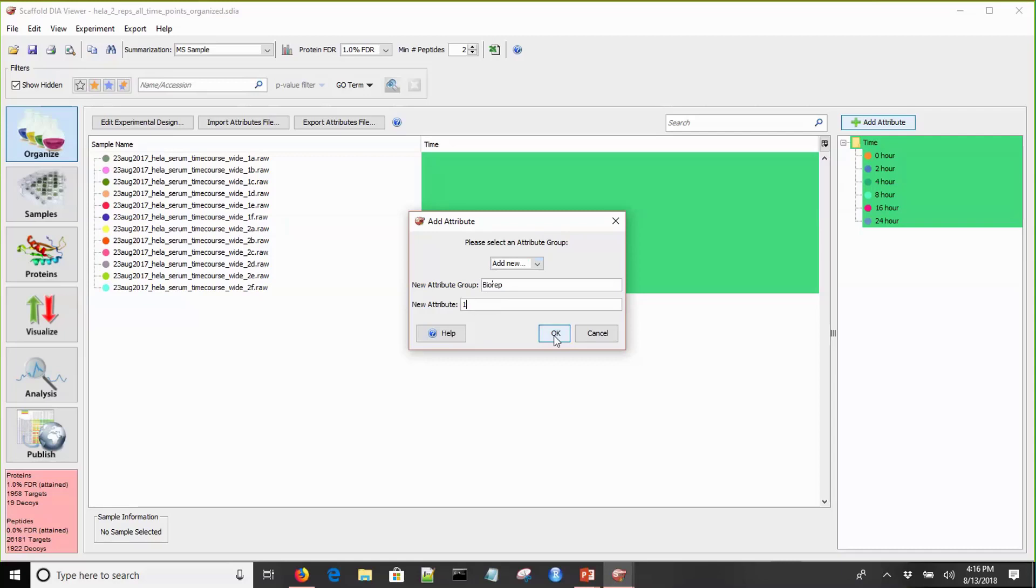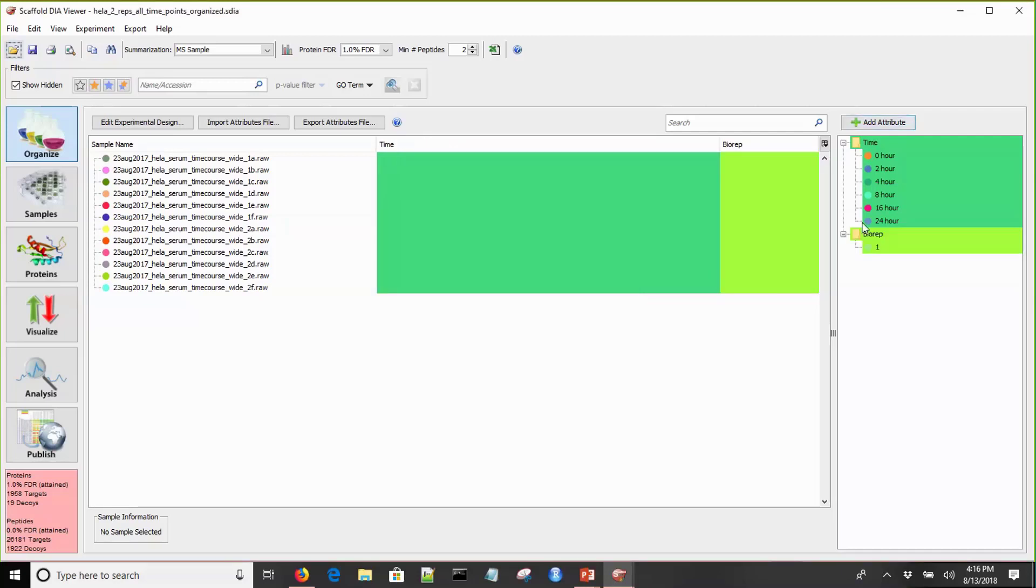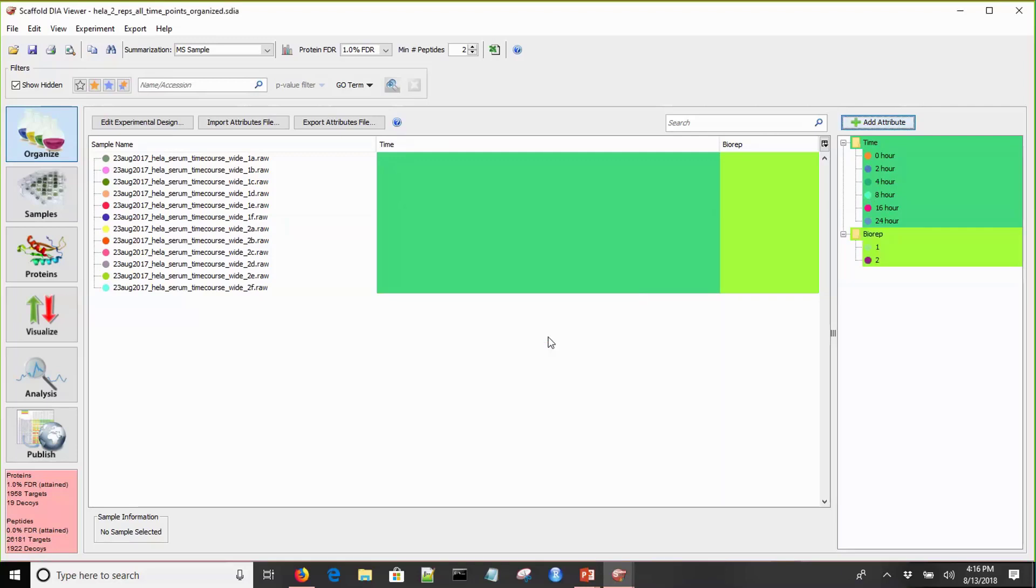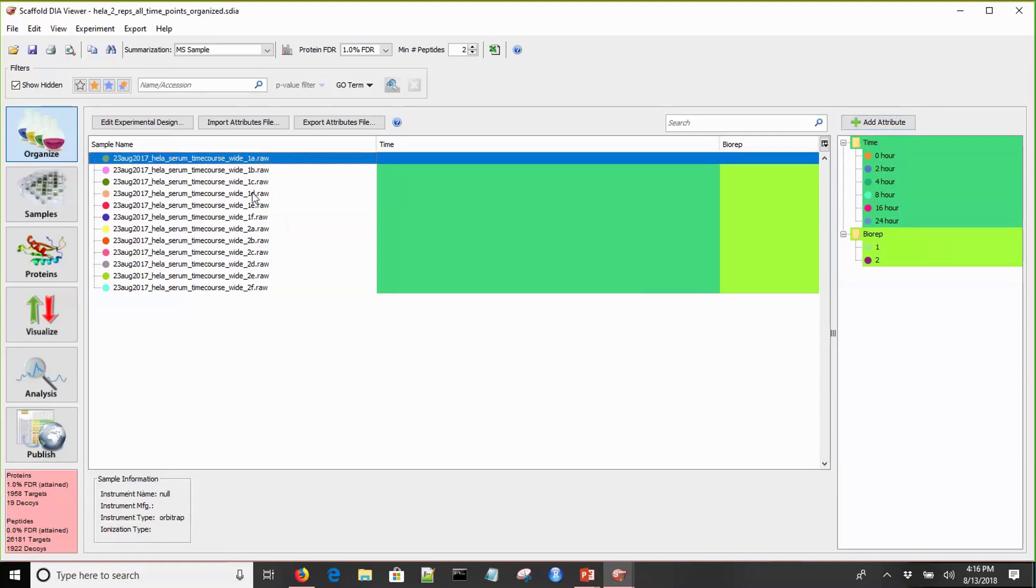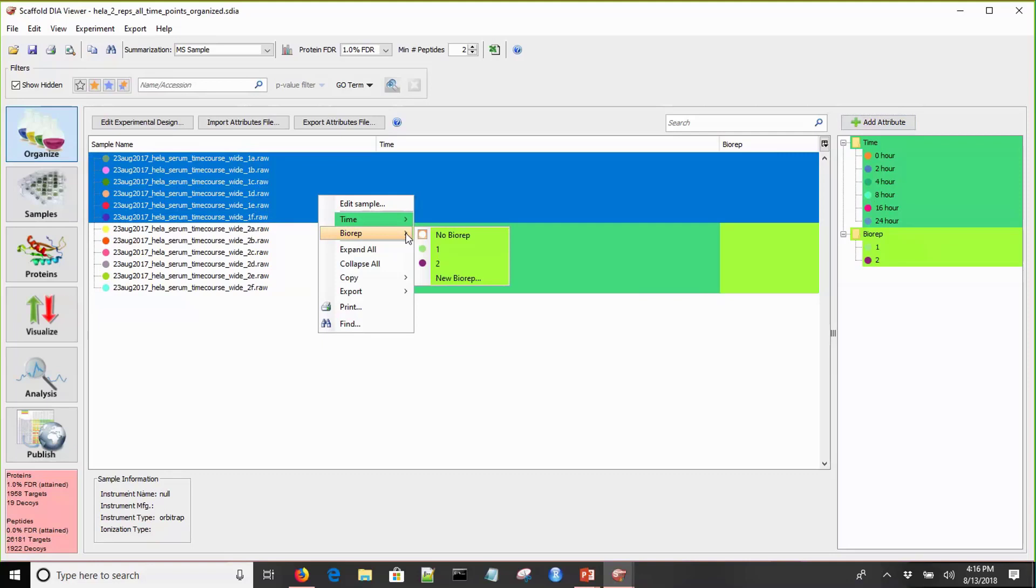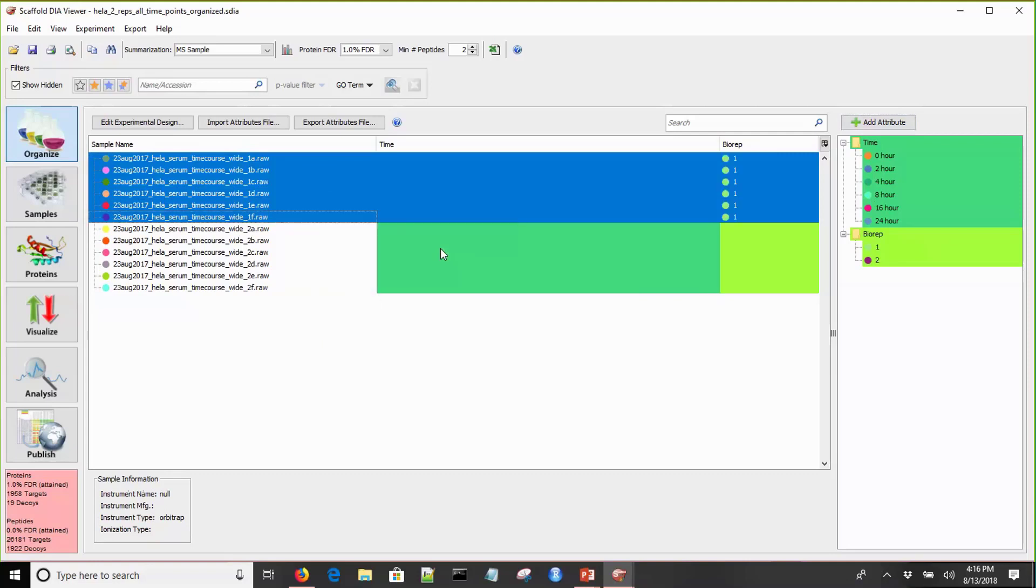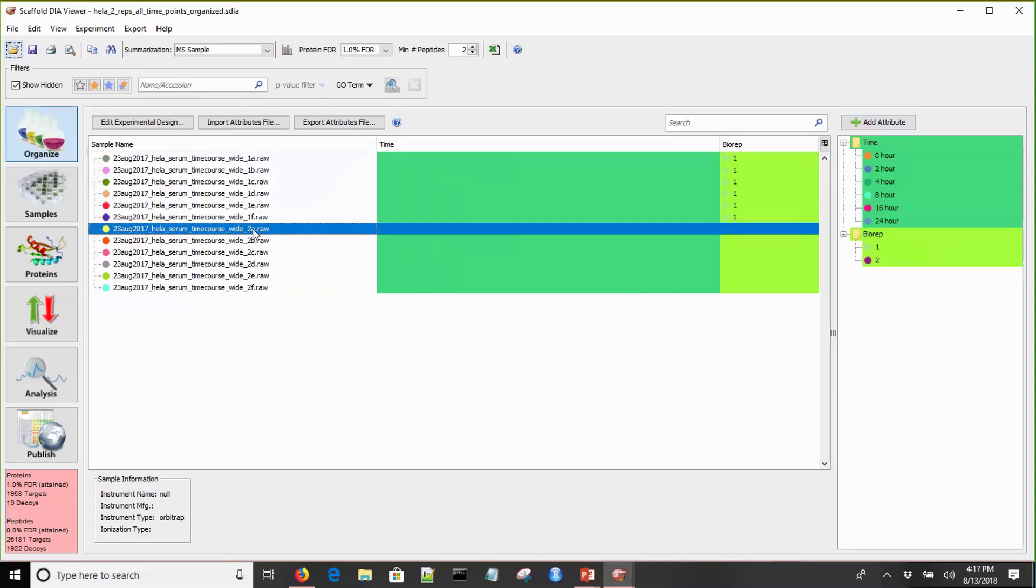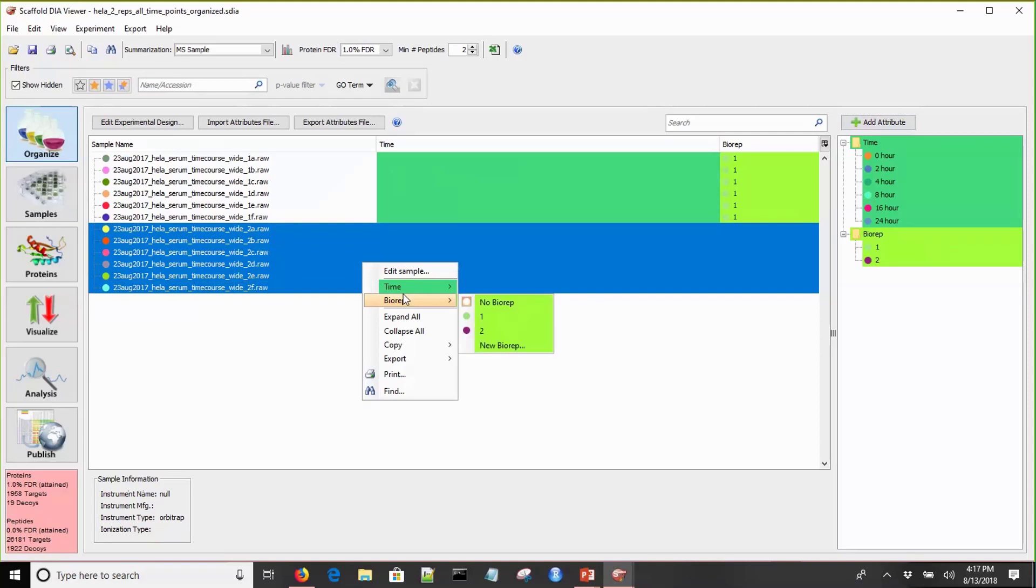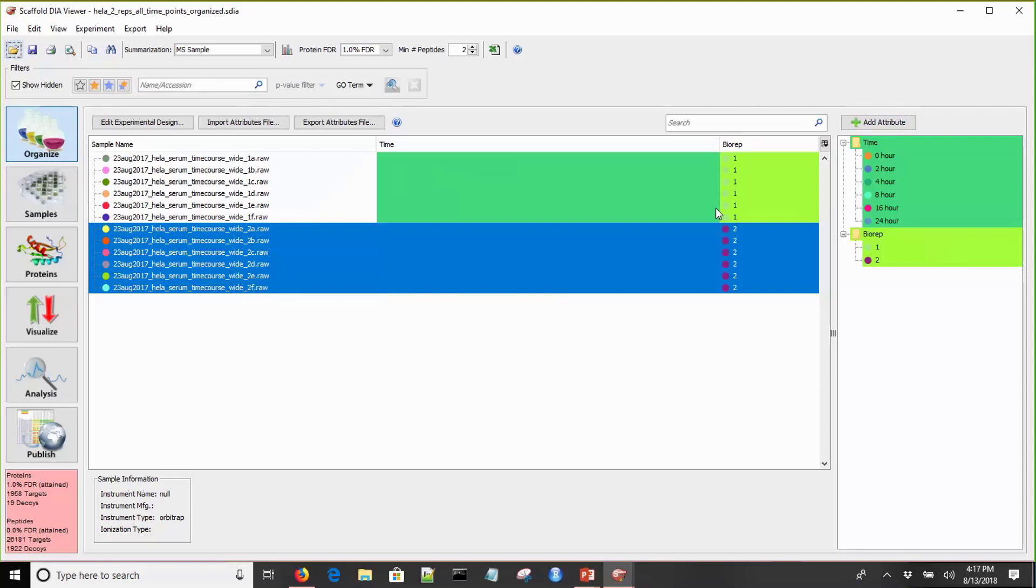We'll click on that add attribute button, come down here and select add new. Let's add a bio rep attribute group, and we'll define the fact that there are two biological replicates in this experiment. We'll do bio rep 1 and add that, and you see it's added over here. Now we'll click on this again and add bio rep number 2 within this biological replicate attribute group. Now that we have all of our attributes and attribute groups defined, we have to actually tag our samples with these.